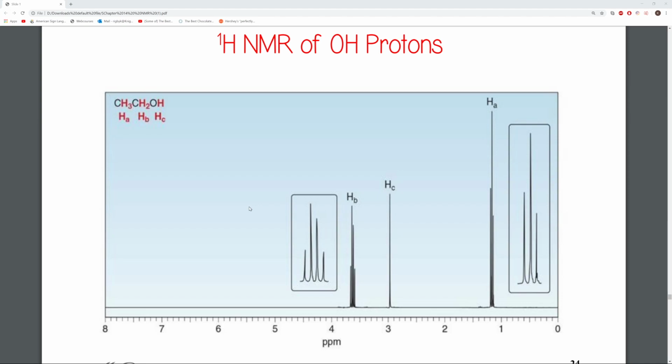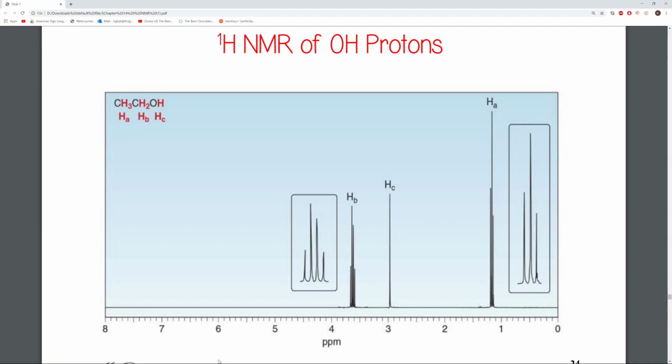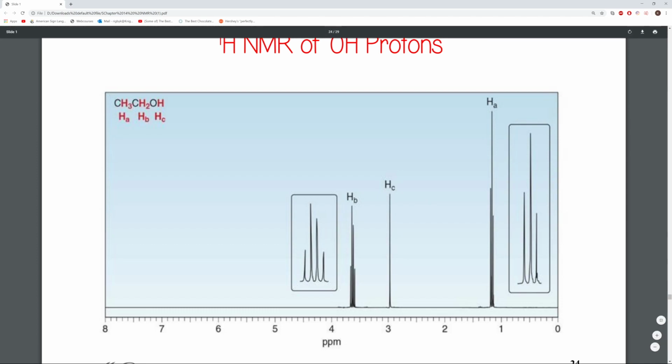So, for example, this CH3CH2OH, it's going to have a very significant, really broad peak in the 3500 region because of that OH group. And then the mass spec would tell us the total weight of it. So we can see we have 3 different types of protons. We can see the total weight, and we know that there's an OH group in it. Okay, and then if we know there's an OH group in it, we know that it's probably too far to be affected by the other hydrogens. So it's probably going to be our hydrogen that is not split. And then we would just go on from there.